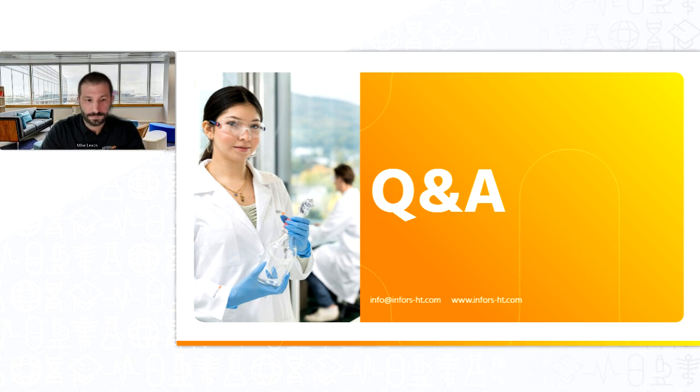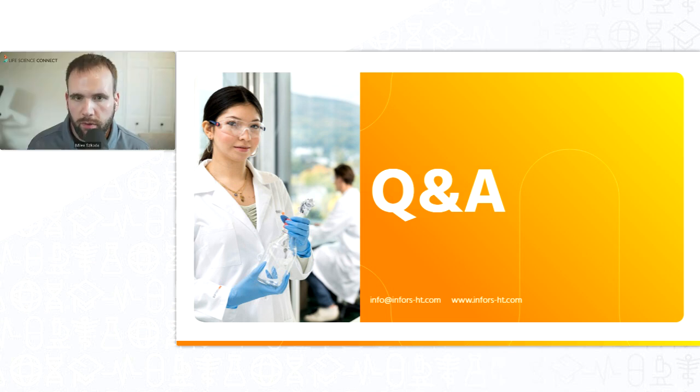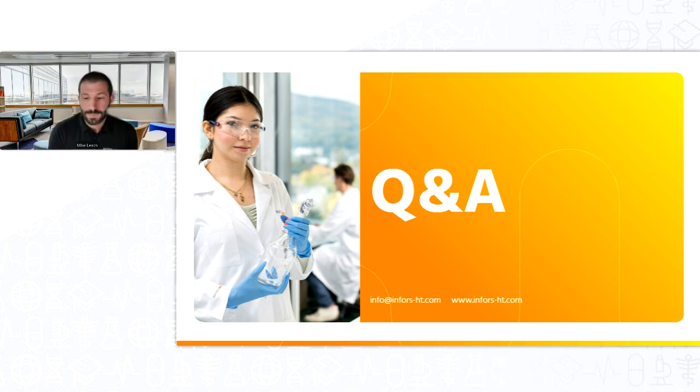All right, beautiful. Thanks, Mike. Let's get into a few more here. Do you think we can make small-scale lentivirus in 96 well plates with suspension HEK293 cells in the Multitron? Yeah, I can take that question. So yes, you can. We do currently have a lot of customers doing that.